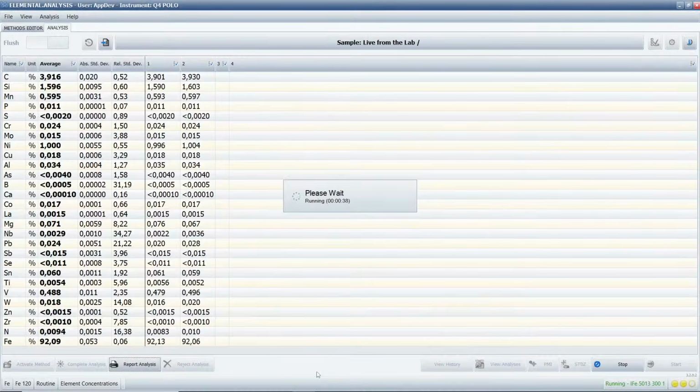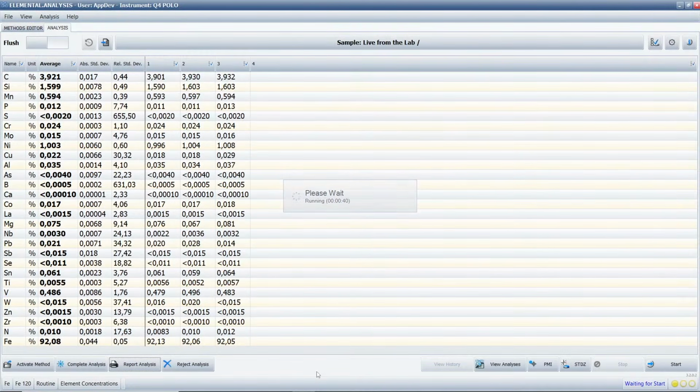What are the hard samples? For the hard samples, could be iron base, could be cobalt, or could be titanium base. Yeah. For the soft material, though, we use machining. So we just machine the sample surface to have a very flat and nice sample surface. That's why we're using milling for aluminum, magnesium, tin, lead, this kind of soft materials.